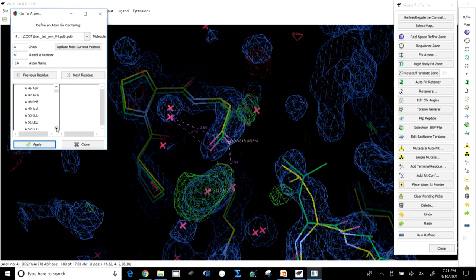This is also one type of protein engineering, which we are going to discuss in our last two modules. Here we are actually talking about those. One is structure based drug designing. This is one of the perfect examples of structure based drug designing, and along with that we will also talk about protein engineering. So, if you go there in the PDB file, you see waters are there, amino acids are there, and in between you will see that there are phosphates and something which is not common.